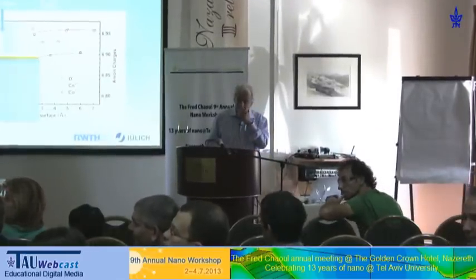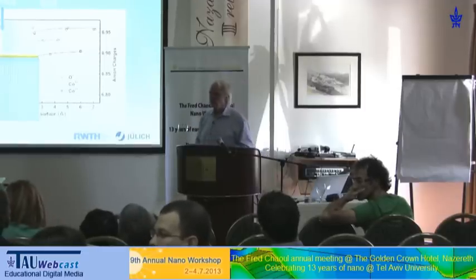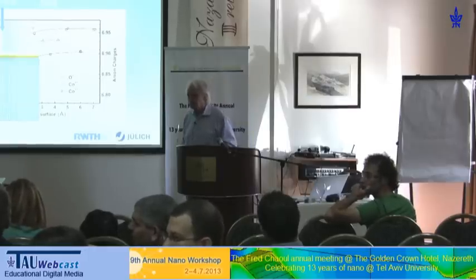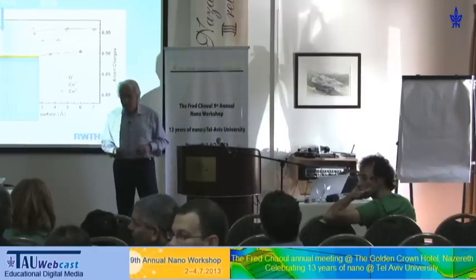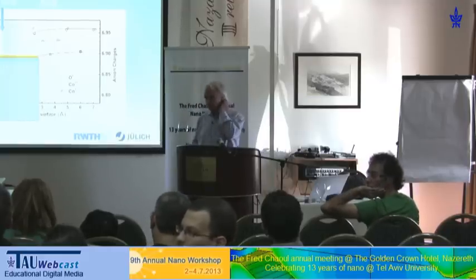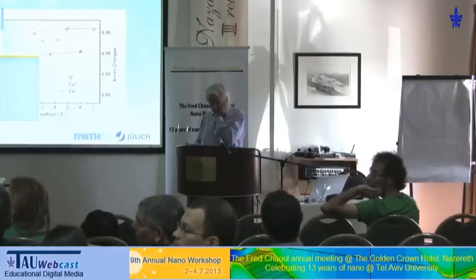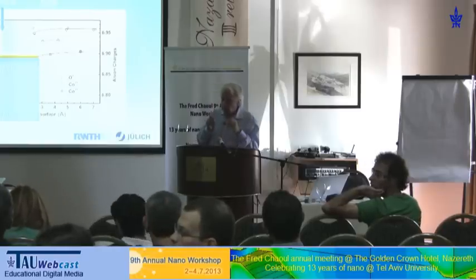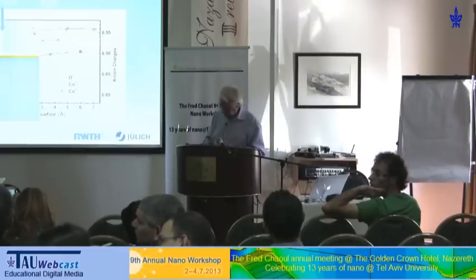I have two questions, both of them related to the thickness of the sample. In one part, you showed columns where you have a mixture of two atoms, like aluminum, titanium, or zirconium, titanium. So what is the error bar there, and can you go down to a single atom replacement? And the other question is, those samples you didn't mention, but the samples are quite difficult to prepare, right? They are about a few nanometers thick, and they need to be fairly uniform. What's the influence of creating a surface on both sides of the sample? And often it is done quite energetically, right?